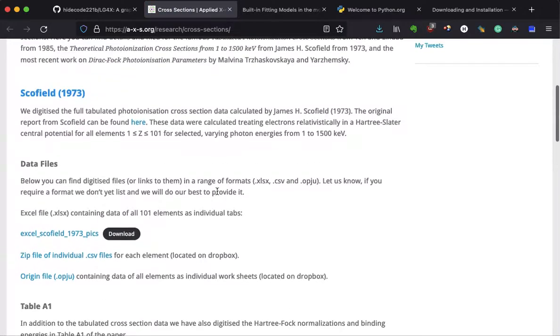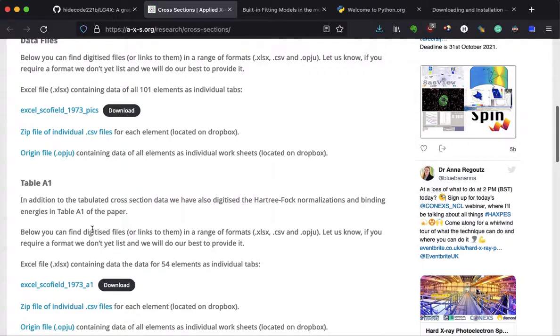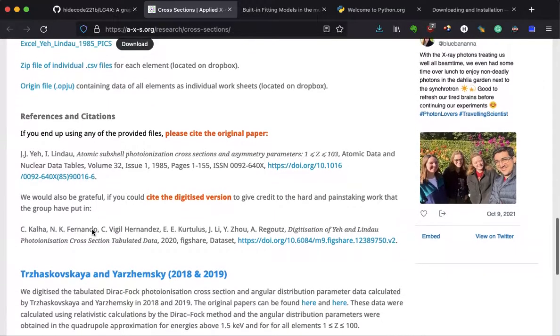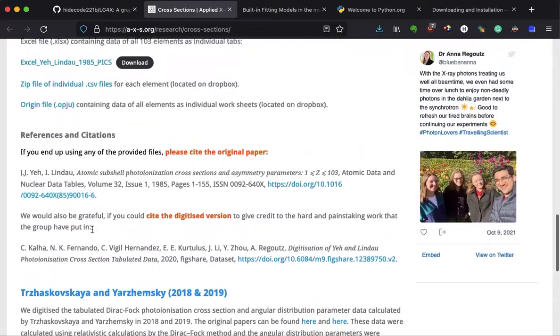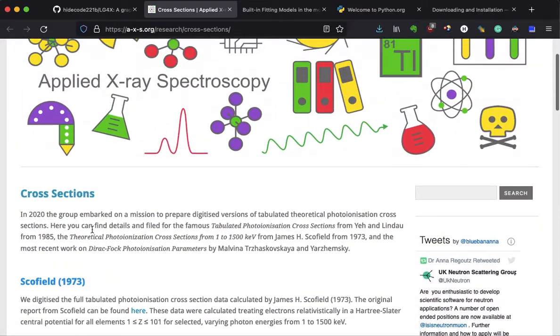You can see the cross section. The cross section, you can get the data. Even hard X-ray photoemission spectroscopy is now available. Some places you can get the sensitivity factor, sometimes called photoionization cross section.